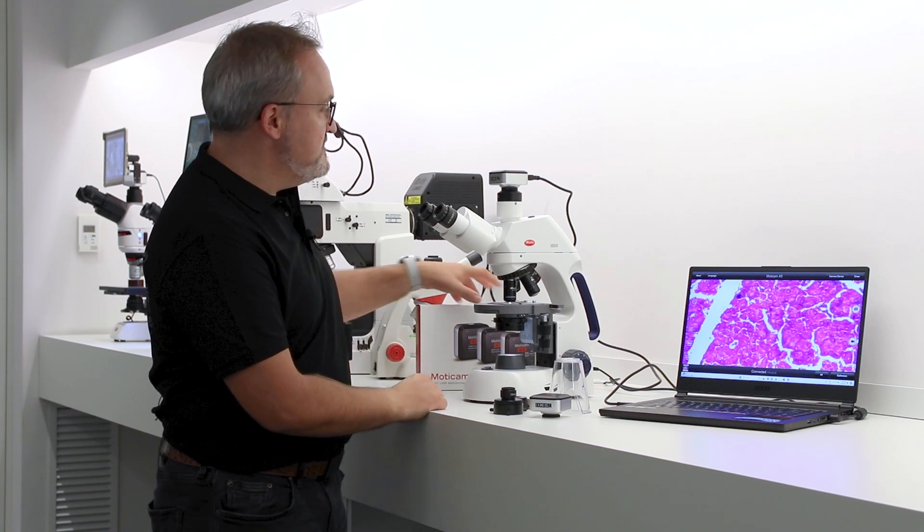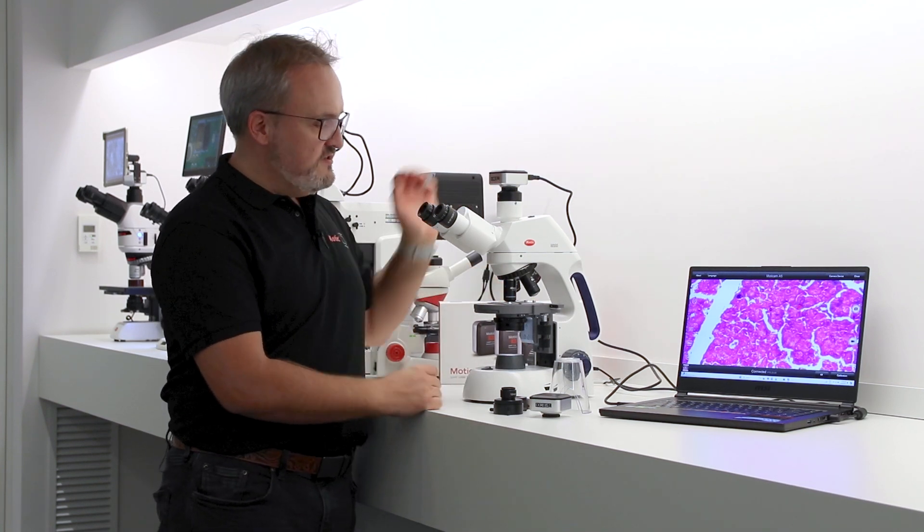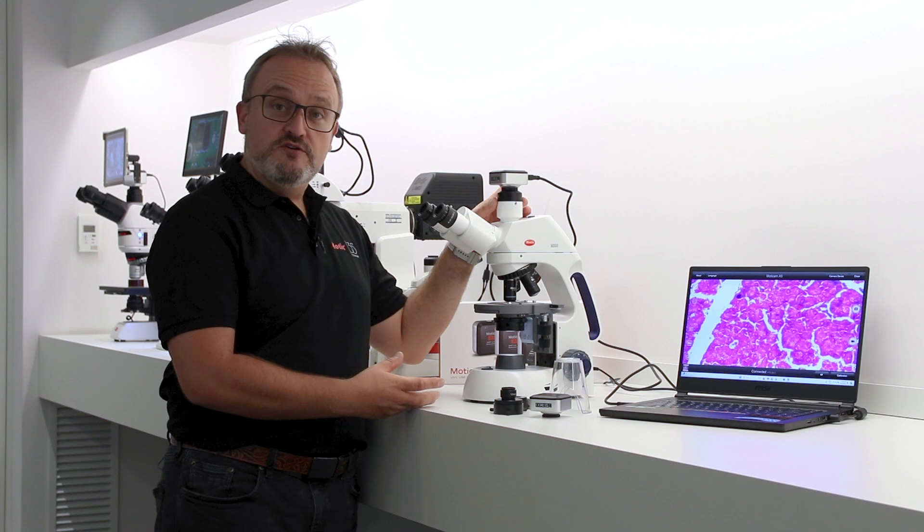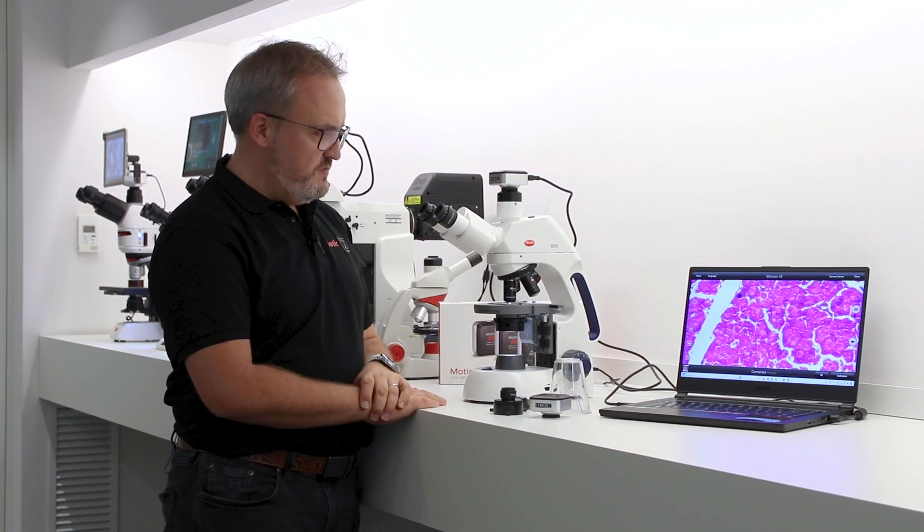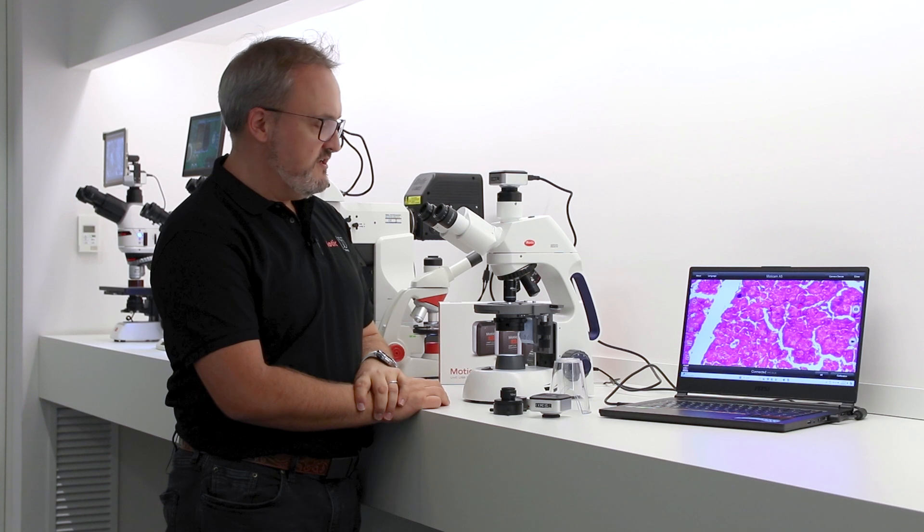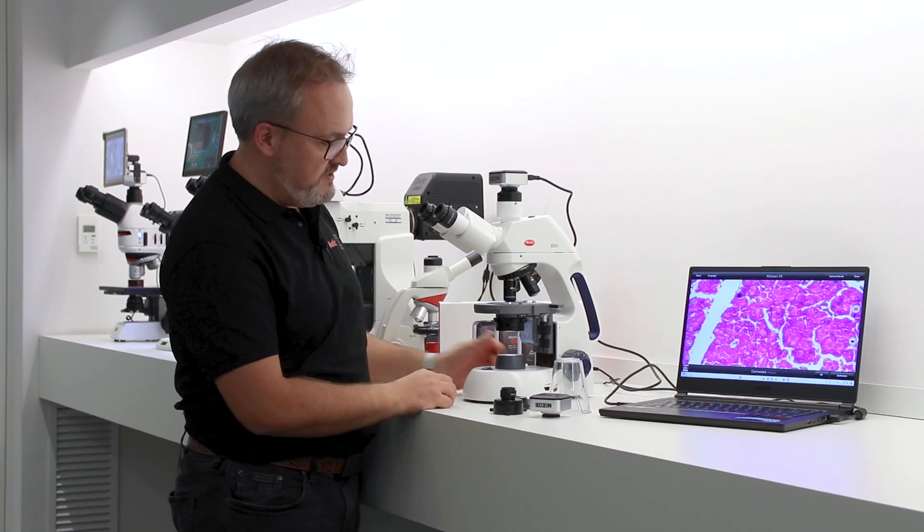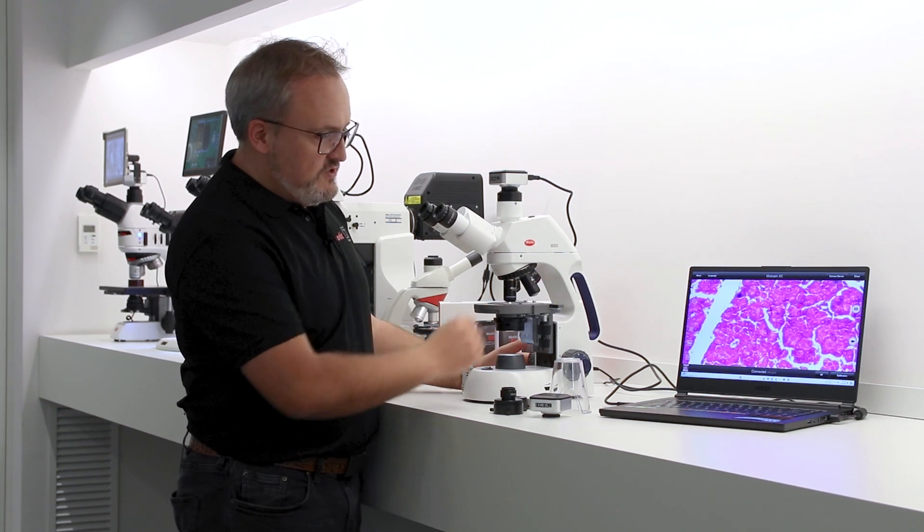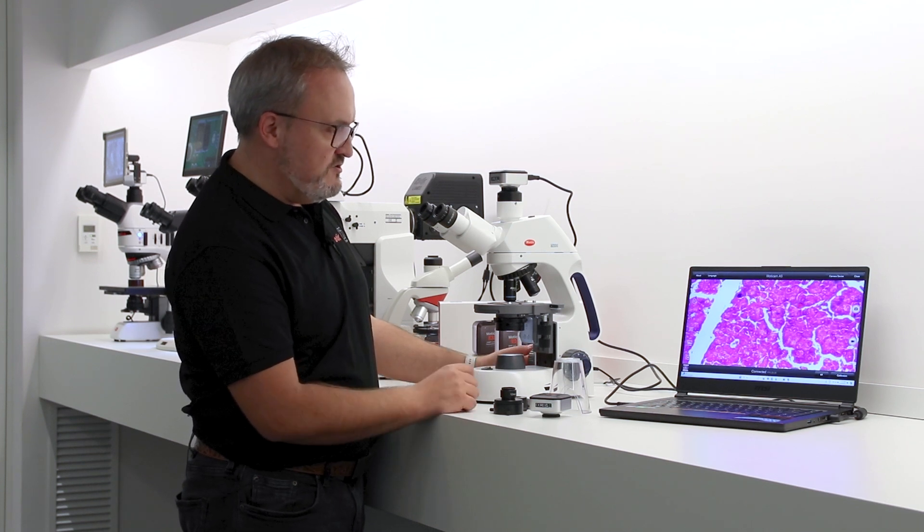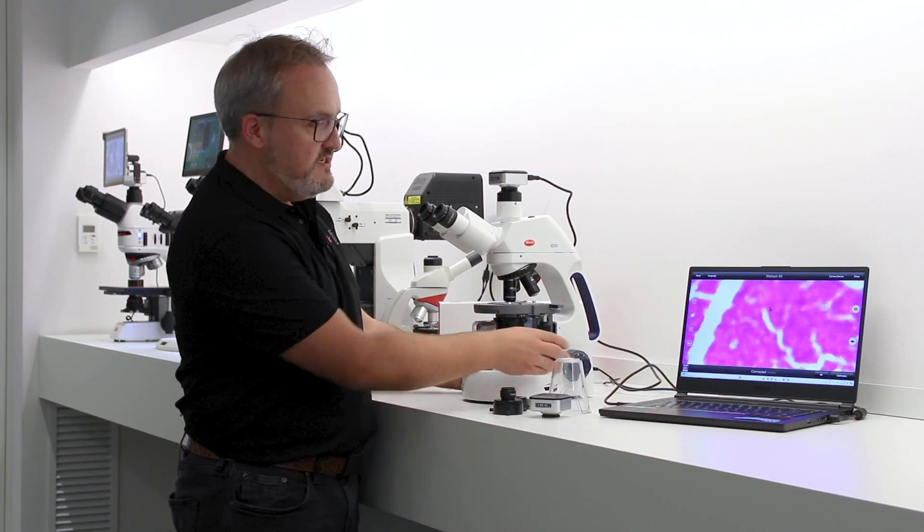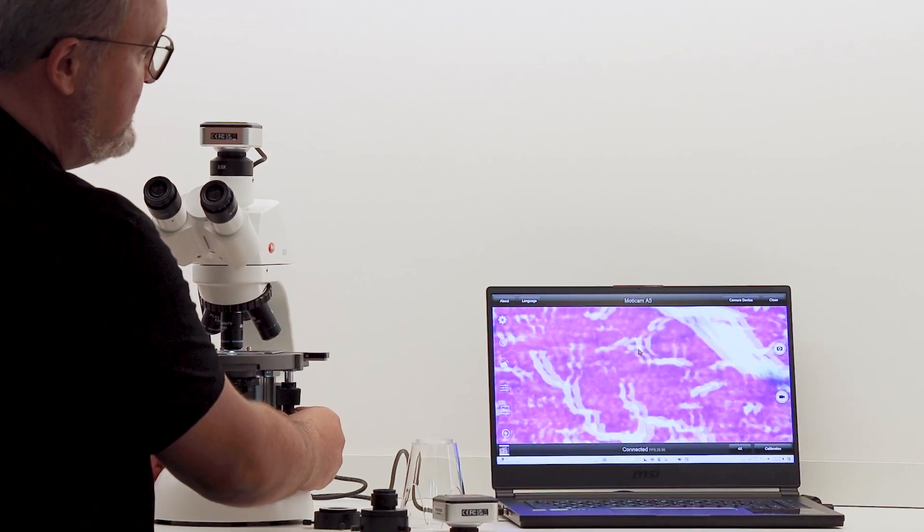In this case here I have connected the MOTICAM A5 to a trinocular microscope, but we will look at other systems in a minute. I have it connected to this laptop and I can see that it's about 29 to 30 frames per second, so the image transmission is live.